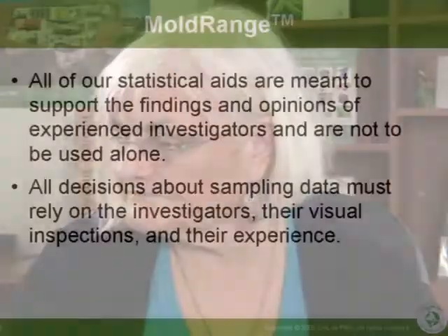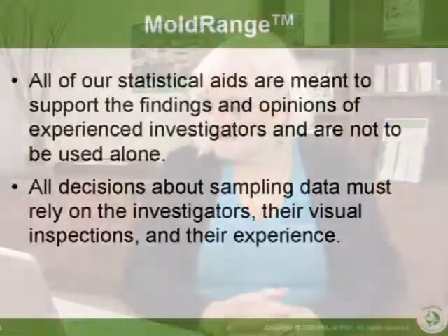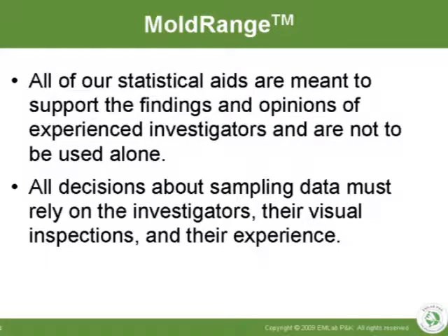All of our statistical aids are meant to be used by experienced investigators and are not to be used alone for the interpretation of data. All the decisions about sampling data must be made by the person who actually collected the samples and was on site looking at the conditions in the space and using their experience.